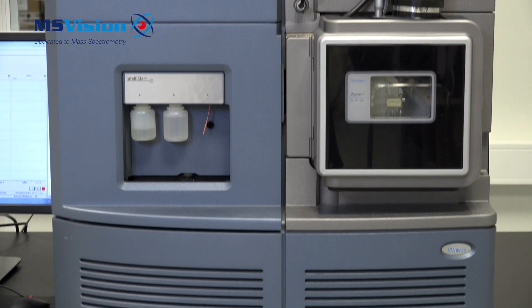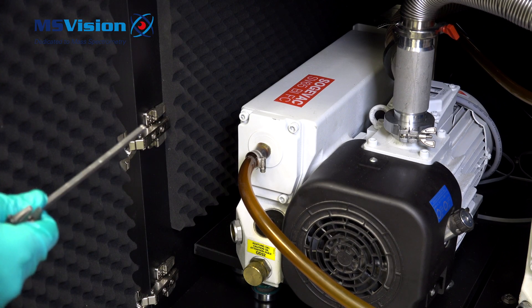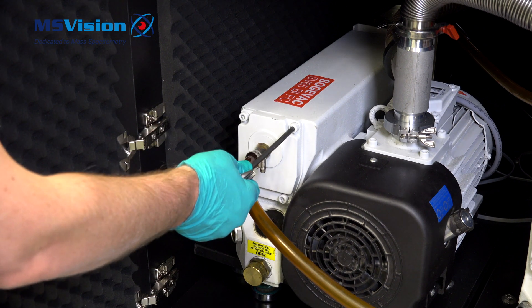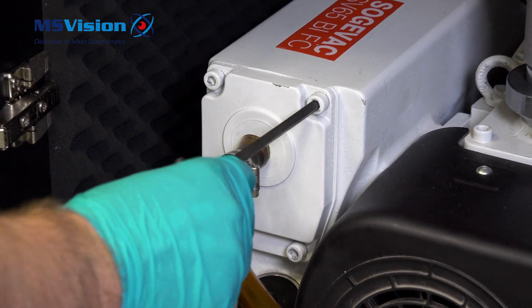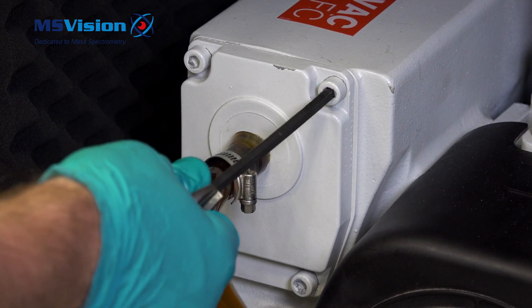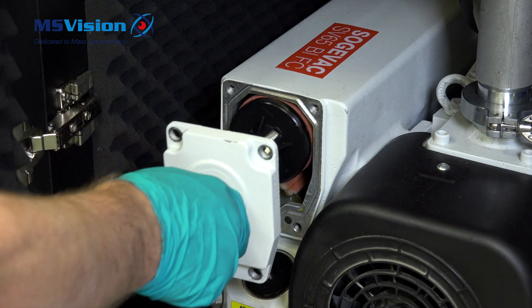The procedure to change the filters on the SV65 and SV40 is identical except the filter is a different type. Use a 6mm allen key to undo the four bolts. If tight, use a heavy tool to assist. Remove the filter.